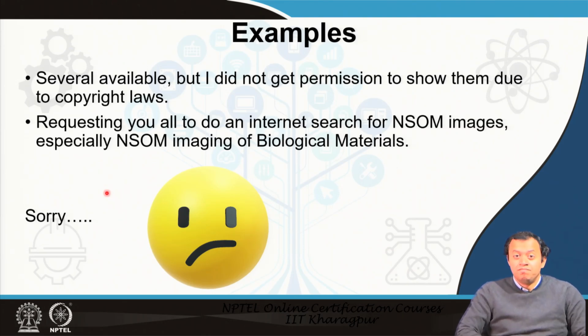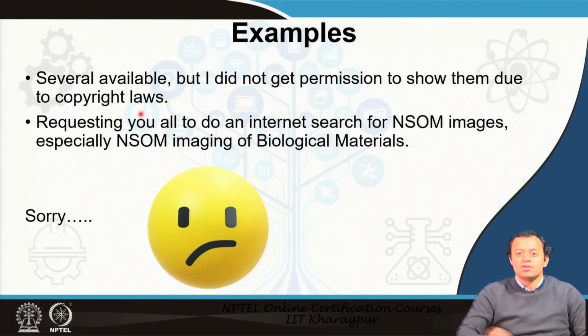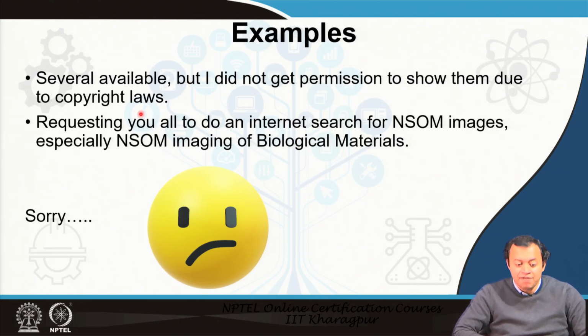There are brilliant examples of this, several available, but I did not get permission to show them due to copyright laws. So please do yourself a favor, do me a favor, and just do an internet search on NSOM images of biological material. Remember, NSOM is an active area of research, so the images are highly copyrighted.